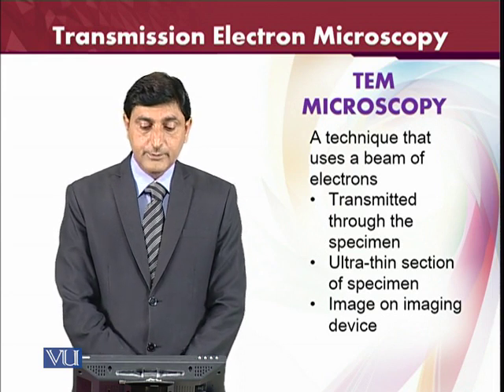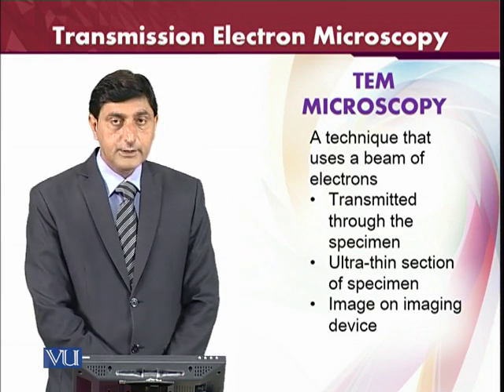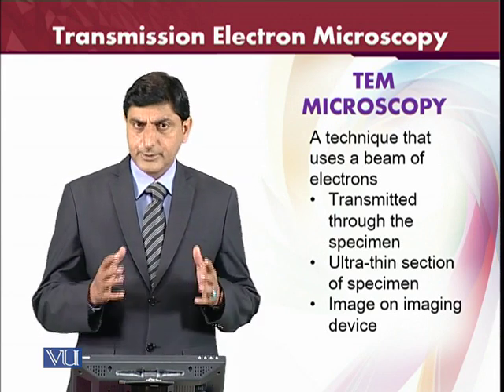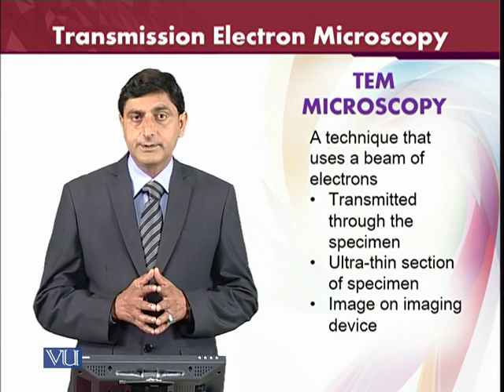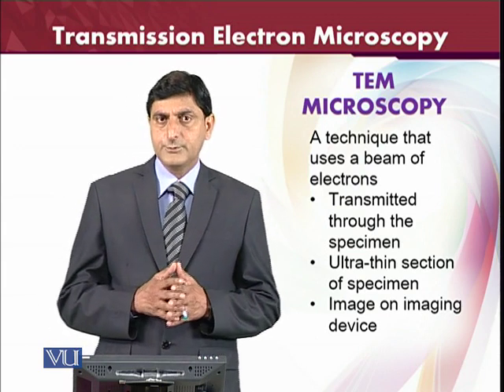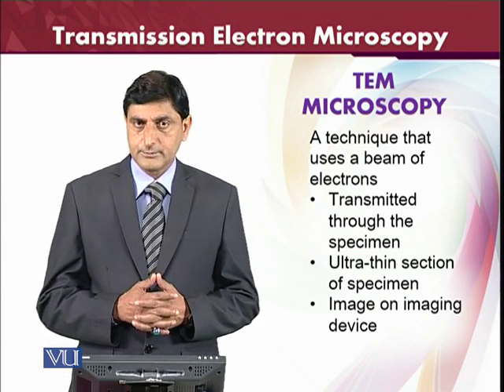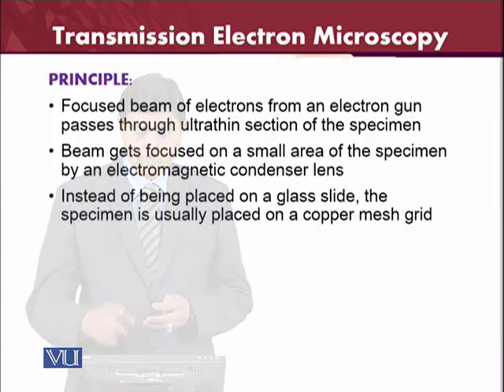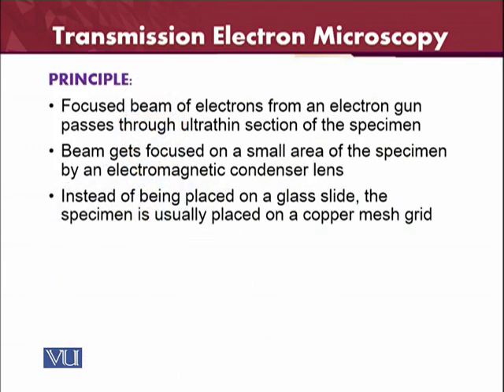In this kind of microscope, a beam of electrons is used, which is transmitted through the specimen, and the specimen should be really ultra thin. The specimen should not be even a little bit thick. There is a special procedure to make the specimen for this kind of microscope.